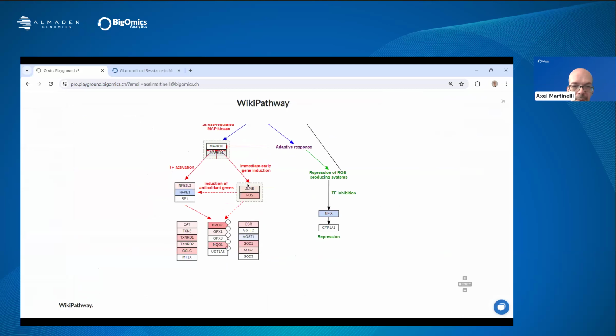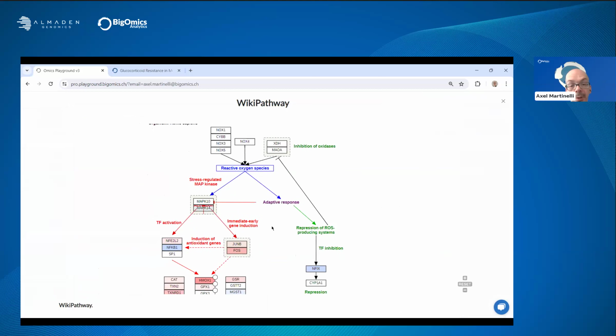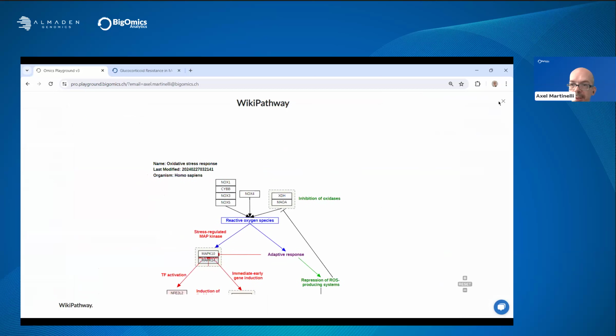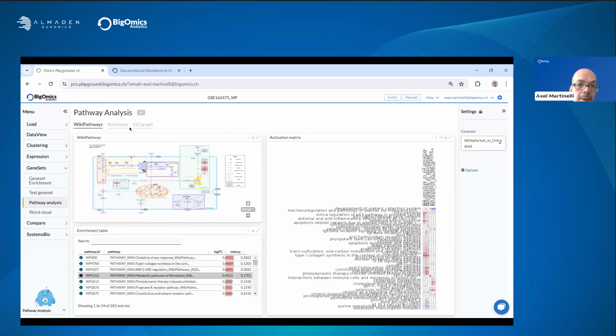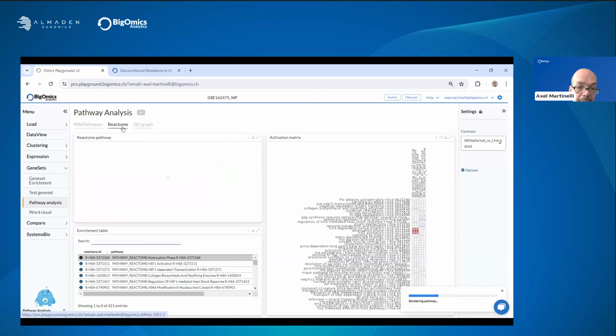And you can see there is a massive upregulation of several components. And with these plots, you just get a nice visual overview of exactly what components are affected rather than just a list of genes. As you go down the list, you can see all the different aspects that are affected here. We can also do exactly the same at the Reactome level.